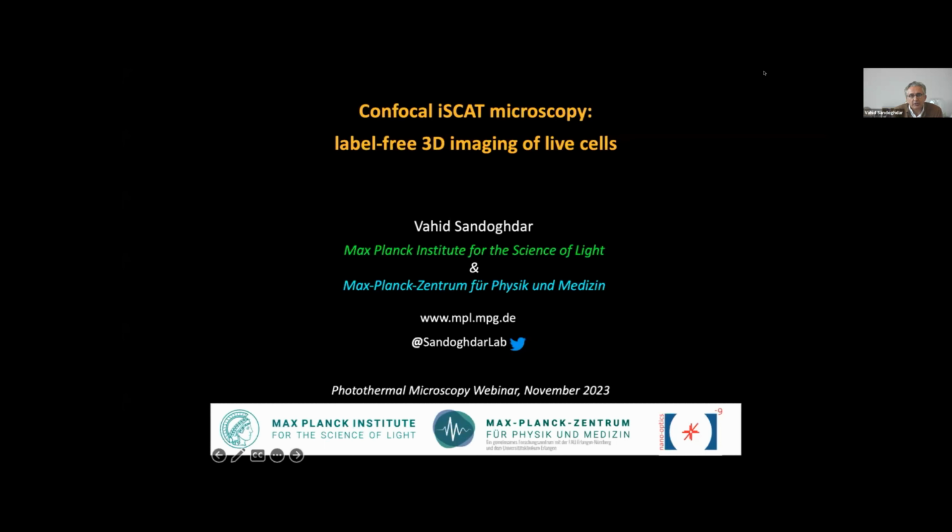I'm going to be speaking about our iSCAT work, but with a focus on one of the latest results, and that concerns iSCAT microscopy in live cells. So in a way, doing label-free 3D imaging in live cells. So let me then jump right in.